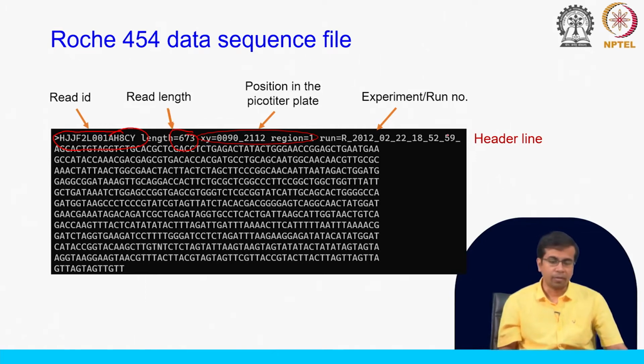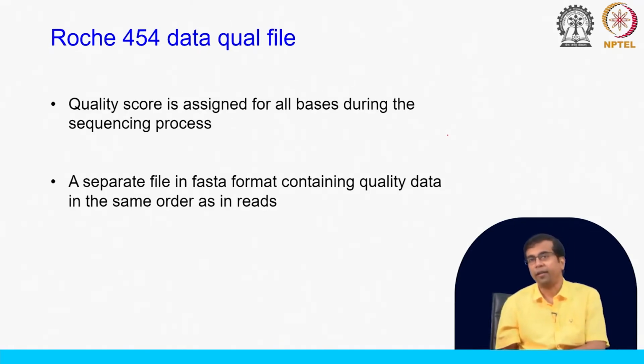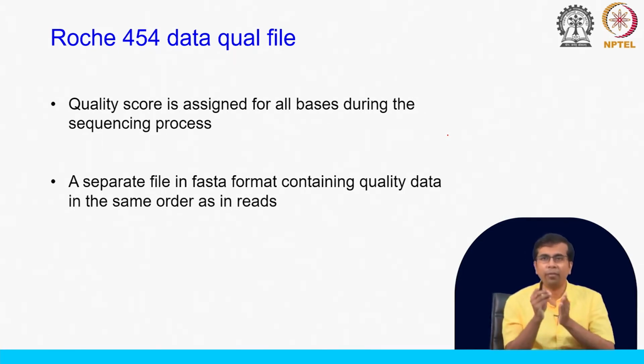Okay. So, once you have the sequence file, you also have the quality score, right. In Sanger sequencing you get the quality score in the AB1 file, and since you are looking at one sequence, you can probably manually go and check the quality score for each of them, right, and maybe you are handling 8-10 sequences at a time in parallel, and that is manageable. In 454 you are dealing with 100,000 reads, 100,000 sequences at once. So, you need to put the quality score in some file where you can process them by writing a program, or some software tools can process this quality score.